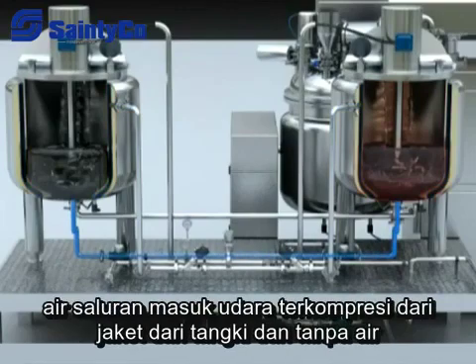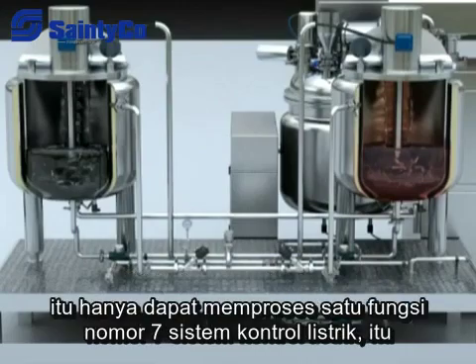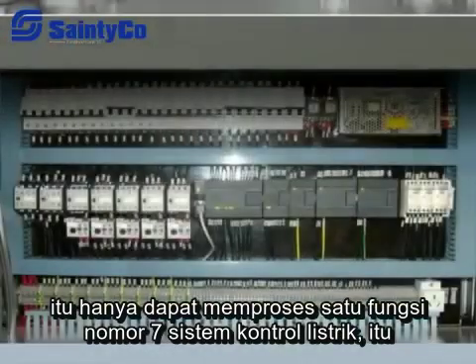When discharging water, compressed air enters from the jacket of the tank and pushes the water out. Heat, cold, and discharge functions cannot be used at the same time; only one function can be processed at a time.